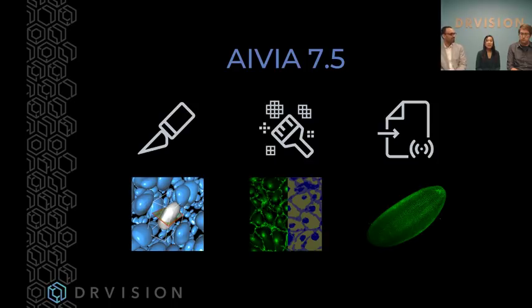Okay. And so some of our users do other pre-processing for their images, one of which is deconvolution. Can you both speak to how the pixel classifier in this case is different from deconvolution? Sure.